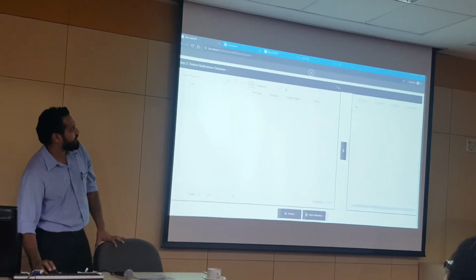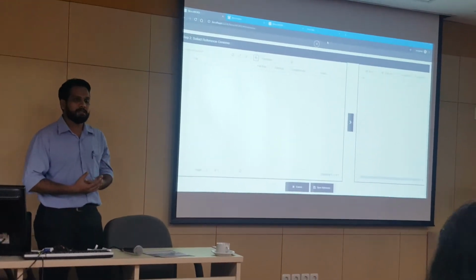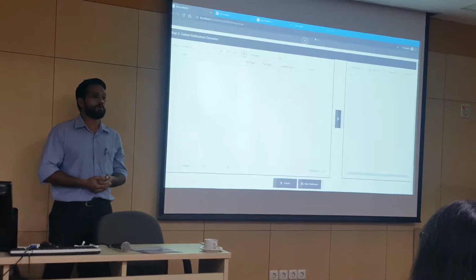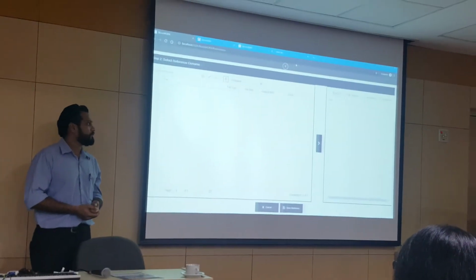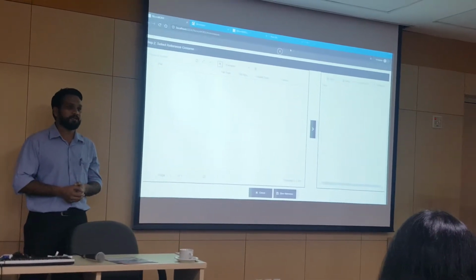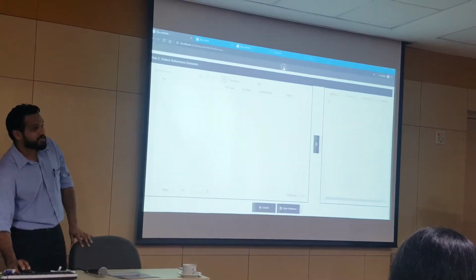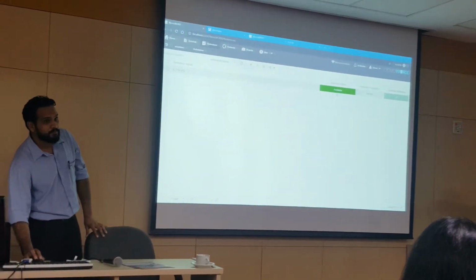So when you click on Save Reference, what it does is it actually goes in the background, creates your own index, and it creates an index that's usable within novoWorx. Because in novoWorx, we use the Apollo genome browser to actually view your genomes. So if you don't build the index for this, then we have some problems with the viewing. So what we do is we build the reference for you in the backend. It will take a bit of time, depending on the size of your reference. And once your reference is ready, it's available here.